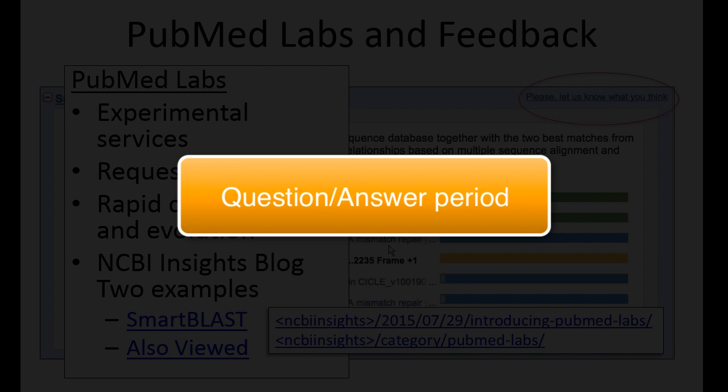There's a question: what if the query sequence is much shorter than database sequences? What you basically see is in the graphical view, you're still going to try to align the whole thing, but you'll see that it doesn't align — the parts of the other proteins that don't align with the query will be shown, so you're going to have a gap at the end. Tao says insulin works fine as a short query. SmartBLAST is not incredibly sensitive, so really short sequences won't give you a lot of results. Also, it's not uncommon to put a sequence in SmartBLAST and get nothing back, since it's designed to find very similar sequences — sequences from metagenomes, for example, may need a full BLASTP search.